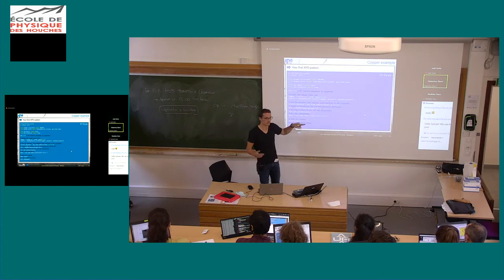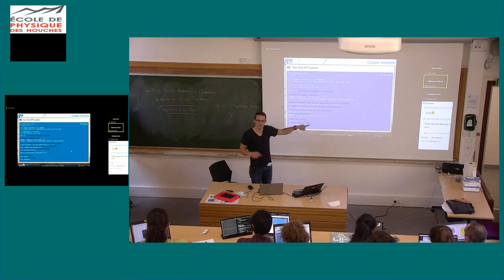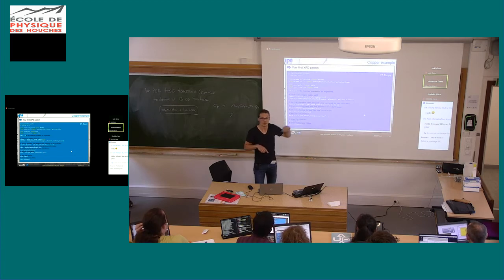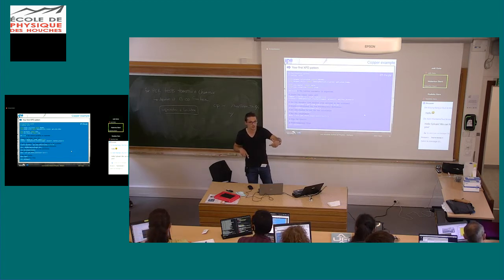So you have to specify the level, and the kinetic energy you are not required to put. You can, of course, it is better, but if you don't know it, if you just want to run the calculation, it will be computed according to a database inside the MsSpec. MsSpec will look for the 2p level of copper. It will look for your excitation energy source, and then compute roughly the kinetic energy that it would be for the photoelectron.